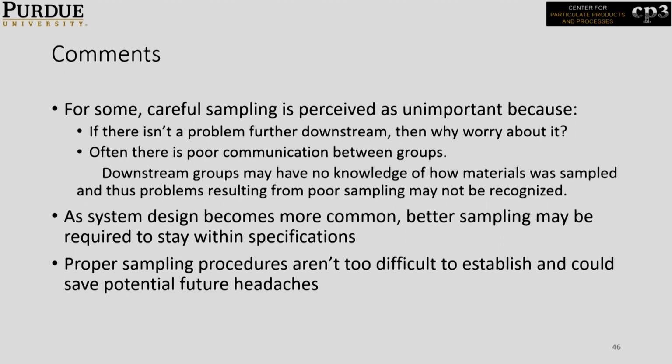And again, better sampling. So proper sampling, as we saw, is not very difficult to establish. It's very easy. You should know some statistics. You should have some simple sampling equipment. That's what you need to establish a sampling protocol. Okay, it's very easy to develop and very easy to implement.